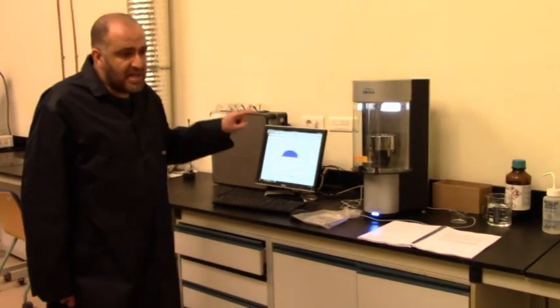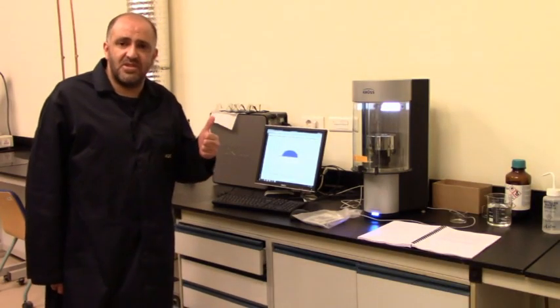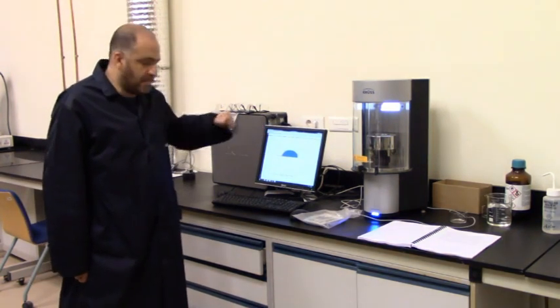However, our case will depend on measuring forces. That's why we need to find the so-called surface tension and then the wetted length. And wetted length is very special to this method. Otherwise, we will not use it in this graphically oriented way.